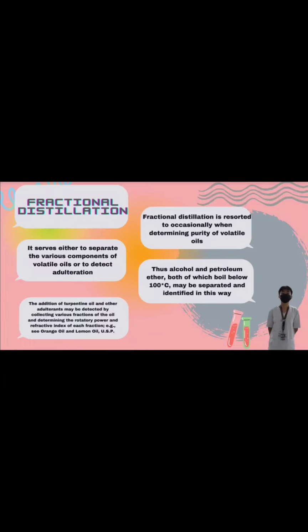So to make it simple, the process of fractional distillation is a technique used to isolate or purify various components present in essential oils. Fractional distillation separates the volatile oil into different fractions or portions at various boiling points. The essential oil is evaporated in the fractioning column and its vapors are allowed to condense at different temperatures.